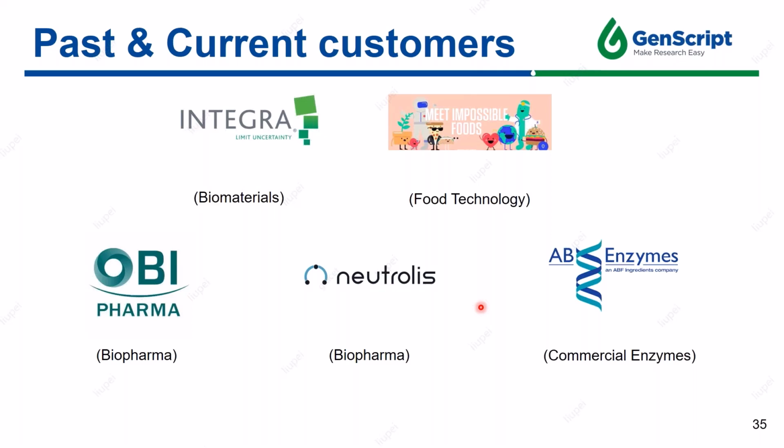The difficulty is it may be difficult to generate an antibody pair which recognizes different epitopes. So to be honest, the sandwich format is the most used during my career. We have provided many services for our customers. The most widely used format. Thank you very much. Move on to the next question.